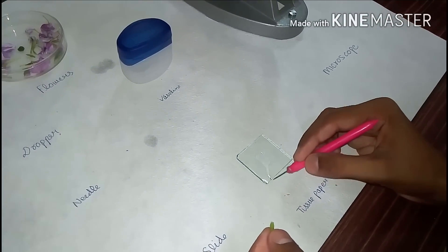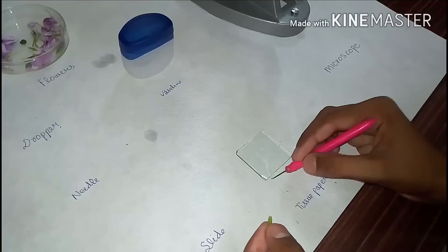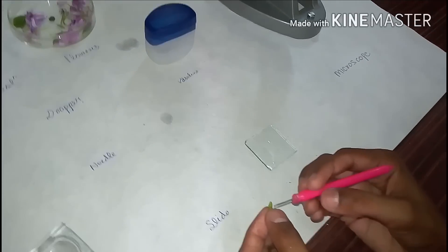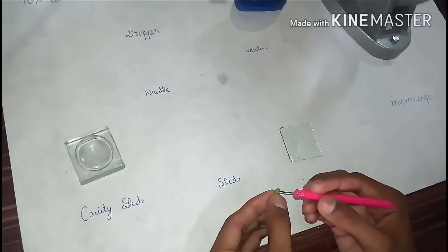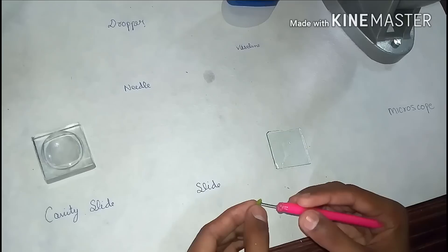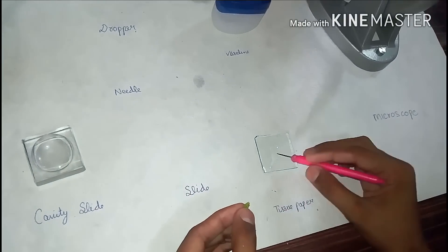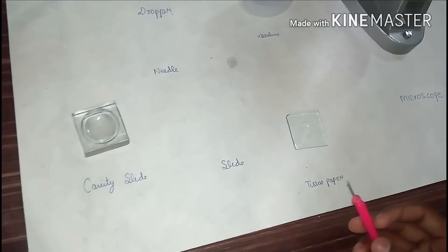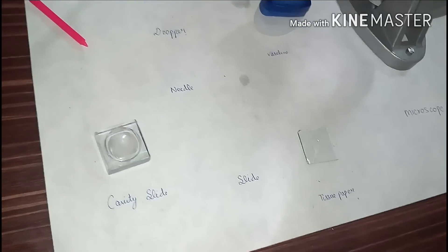Taking it out. Again, trying for more pollen grains. Now we should have the pollen grains, hopefully.